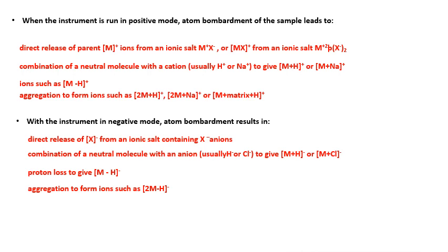The ions leaving the probe are said to be sputtered, and the beam of ions is focused for entry into the mass analyzer. In the last diagram I have shown you the ions that are actually generated by bombarding with xenon atoms. These are called sputtered ions, and this beam of ions is focused for entry to the mass analyzer.